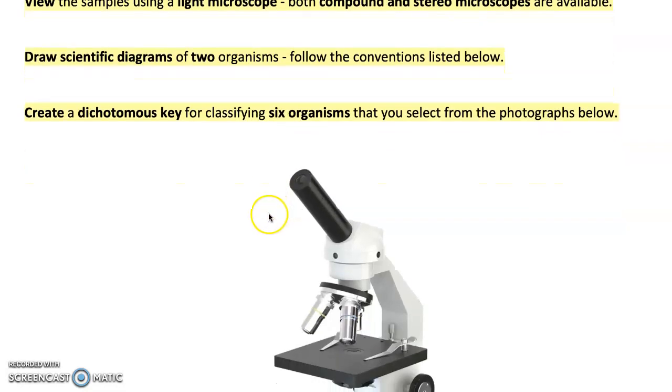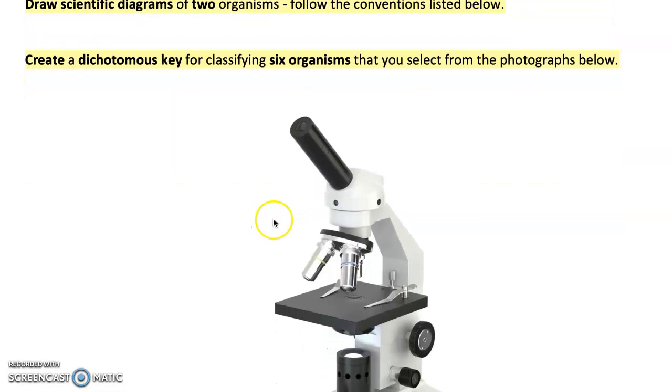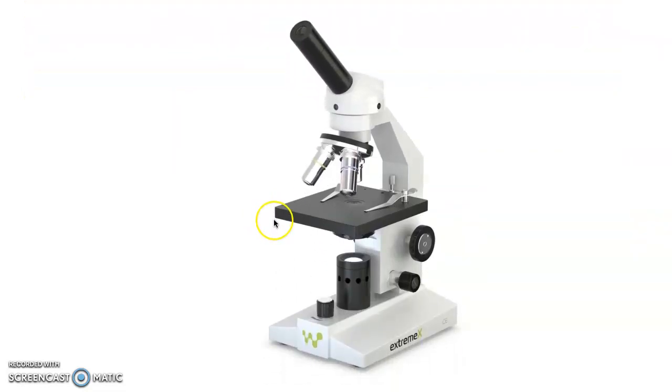As I said before, we have two types of microscopes. This one here is a compound microscope, and it's used for looking at prepared slides. You put your slide here on the stage, you have a light that shines through the slide, and it's called a compound microscope because you've got two lenses that you're looking through. This is the eyepiece, and it has a magnification of 10. Then down here you have your objective lenses.